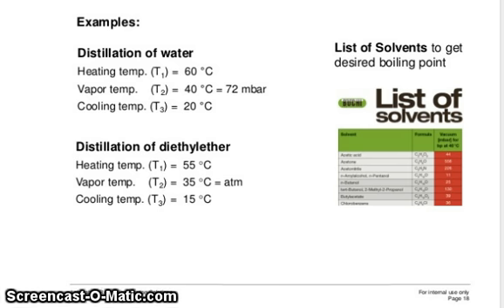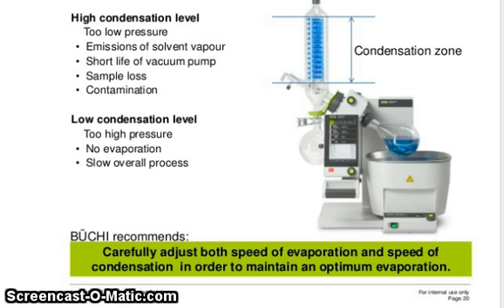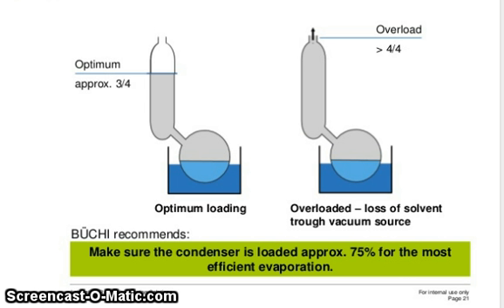Refer to the list of solvents to get the desired boiling point. High condensation load at low pressure causes emission of solvent vapor and short life of the vacuum pump, as well as sample loss and contamination. Low condensation level with too high pressure causes no evaporation and a slow overall process. Carefully adjust both the speed of evaporation and condensation to maintain optimum evaporation. Make sure the condenser is loaded approximately 75% for the most efficient evaporation.